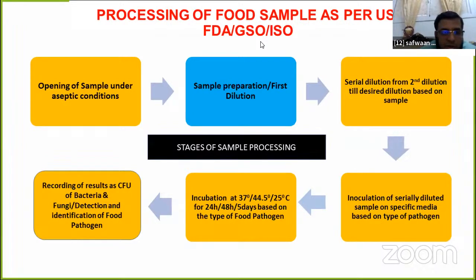The first step: we all know that microbiology work is very sensitive, and we should never open the sample in any other area except under aseptic conditions in the laminar airflow. And there are certain rules to receive the sample. Here, I don't have enough time to discuss this, but some points I will highlight. Before receiving the sample, there are some specifications for microbiology.